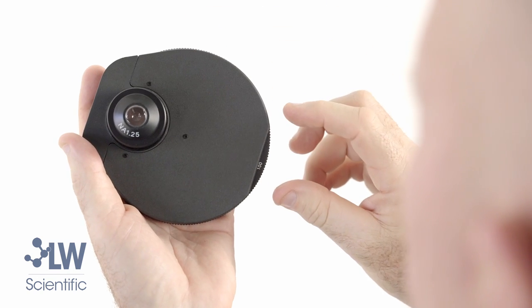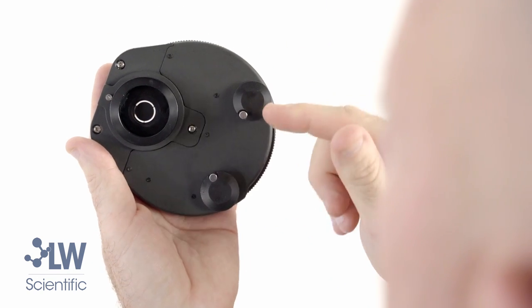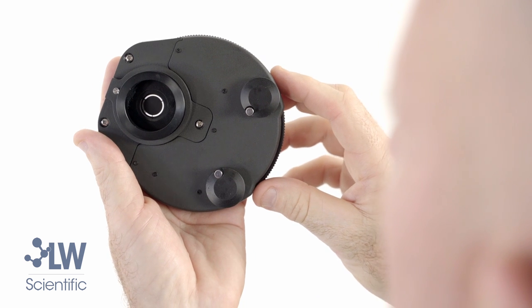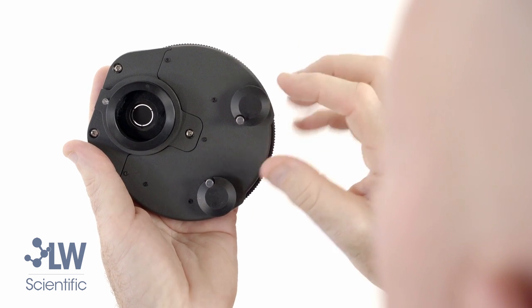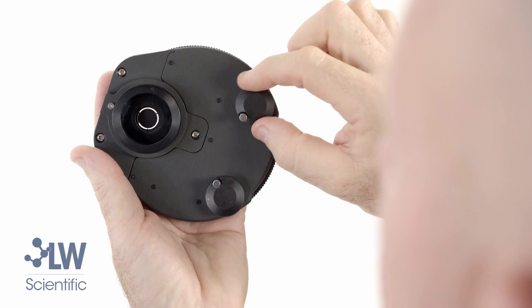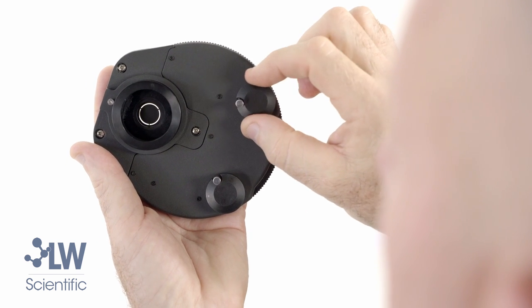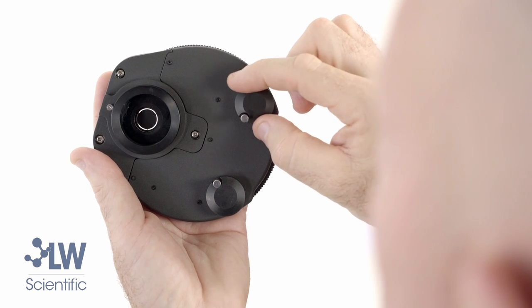There's also a 100x phase setting, and if you look underneath you'll see the annulus rings — I call this the halo because it's creating a halo of light to come up through the slide. As you can see, these alignment wheels help you move this annulus ring, this halo. You will see that later when you are doing the alignment process.